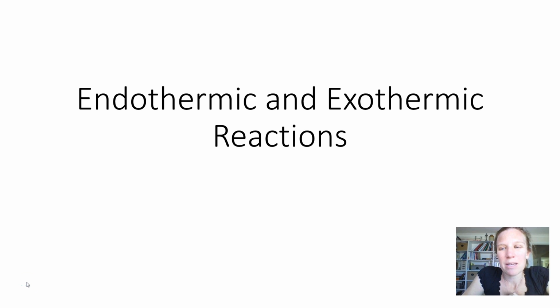Okay, let's look in this next practical activity at endothermic versus exothermic reactions. Endothermic reactions need to take energy from their surroundings in order to drive the reaction, in order to make it happen. So that means that the environment around an endothermic reaction usually becomes cooler, feels colder. And the opposite is true of an exothermic reaction. The vast majority of chemical reactions are exothermic, which means they release heat to their surroundings. So as a result of the chemical reaction, things begin to feel hotter.